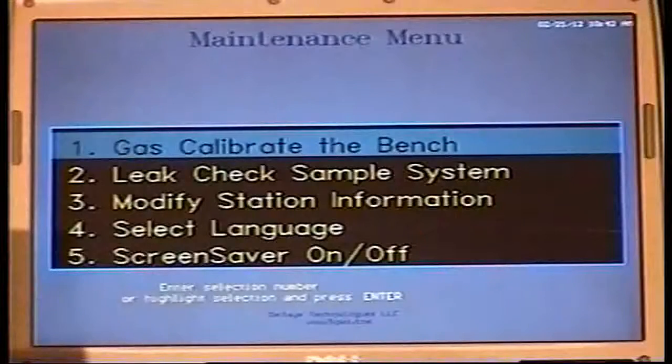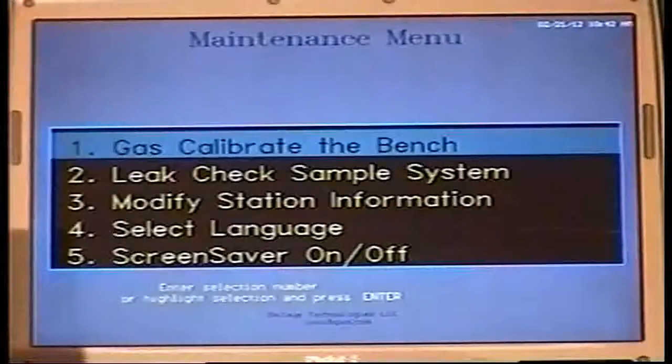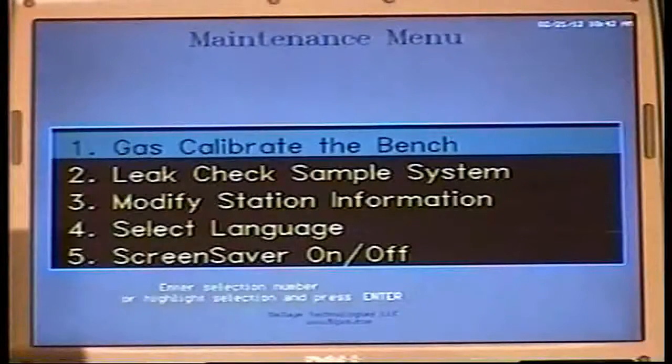After this flag, make sure that you disconnect the tank from the system. And of course, close off your valve on your calibration tank. The analyzer was successfully calibrated. Also, it's generated a calibration report that's gone on the hard drive. So this will give you a pass or fail message, and this calibration report is useful, so if you should get a calibration failure, you can go back and look at the report. More often than not, you entered the wrong gas value on the calibration menu. Again, escape always backs us up.